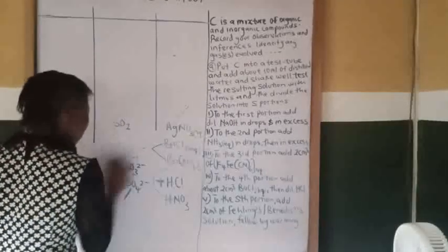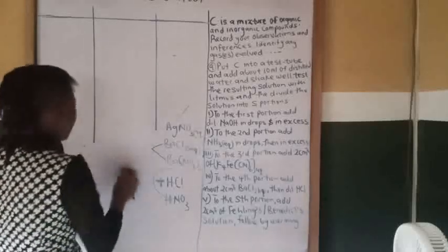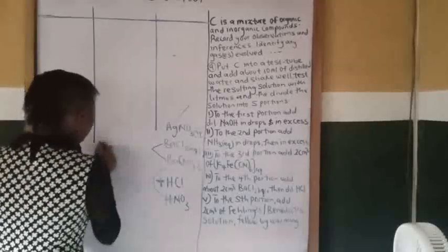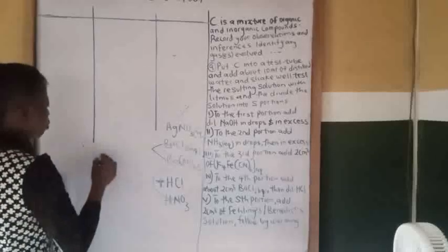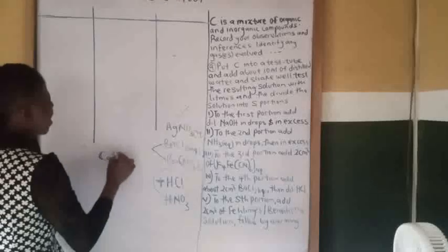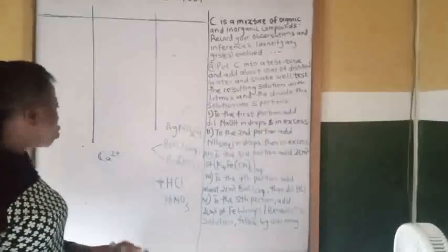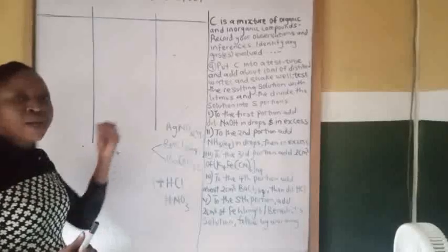Then let's talk about flame test. Let's take, for example, calcium. When calcium is exposed to direct blue flame, it will give you a brick red flame.